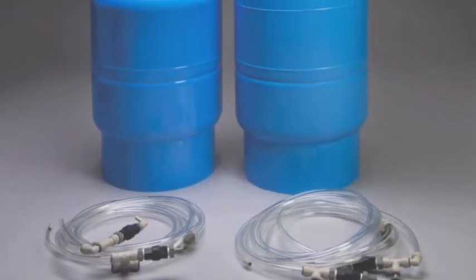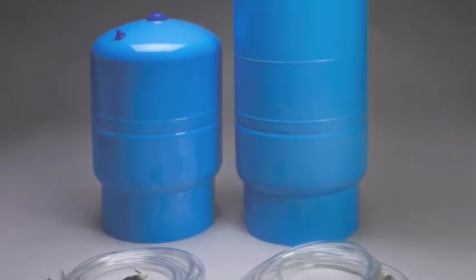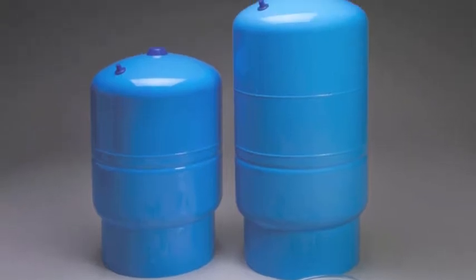If larger volumes of RO water are required, 14-gallon and 20-gallon bladder storage tanks are available.